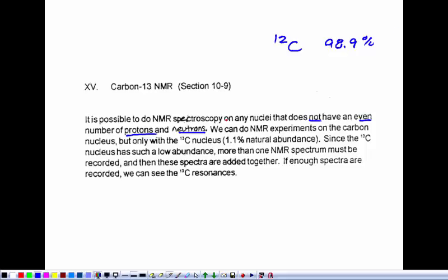But there is an isotope of carbon called carbon-13, and while it's 1.1%, it has 7 neutrons and 6 protons and electrons. So it has a signal. And so a single scan to get a carbon spectrum won't do; we have to take lots of scans and add up the signal over time, but eventually we'll see that 1.1% of the carbon-13 in our sample.